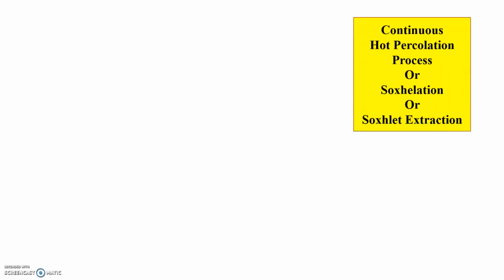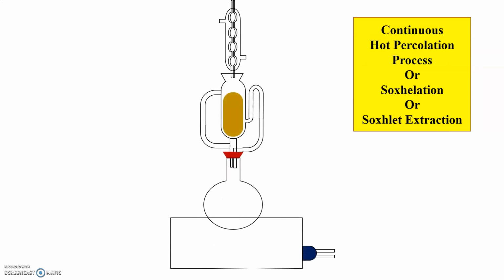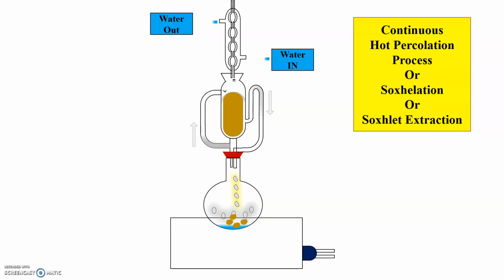In the last video, we have seen about simple distillation. In this video, we are going to see about Soxhlet extraction or continuous hot percolation process.